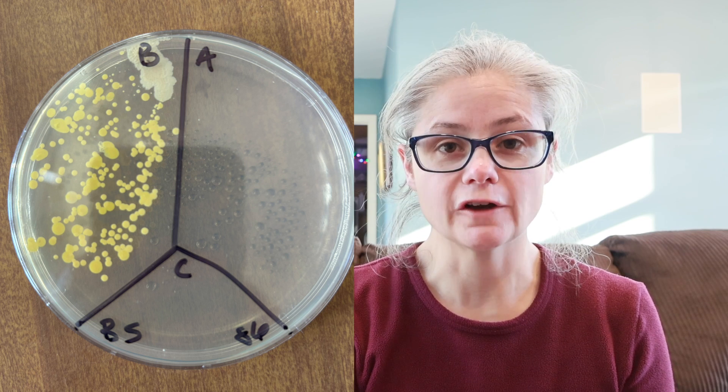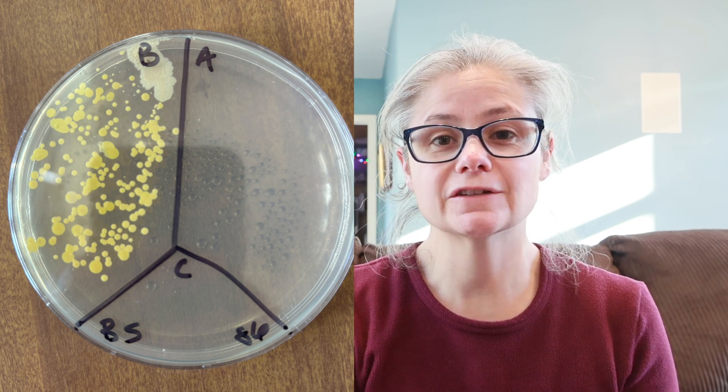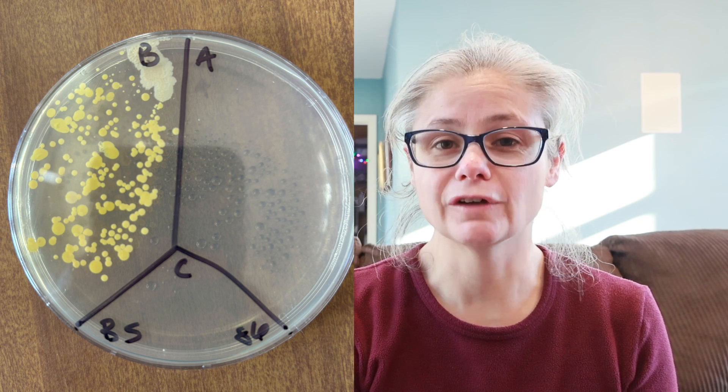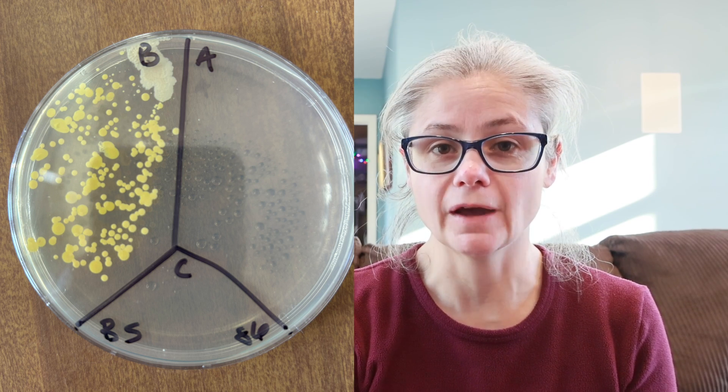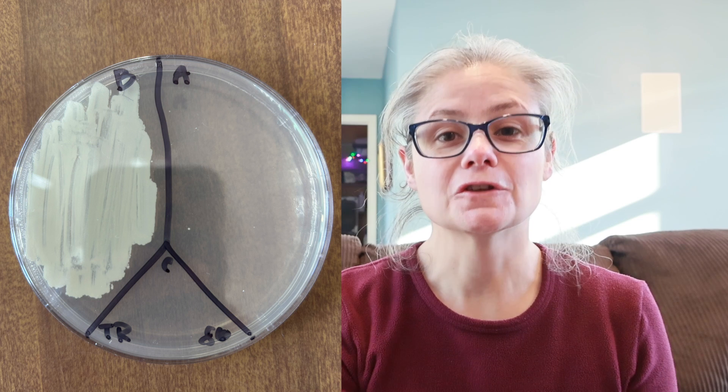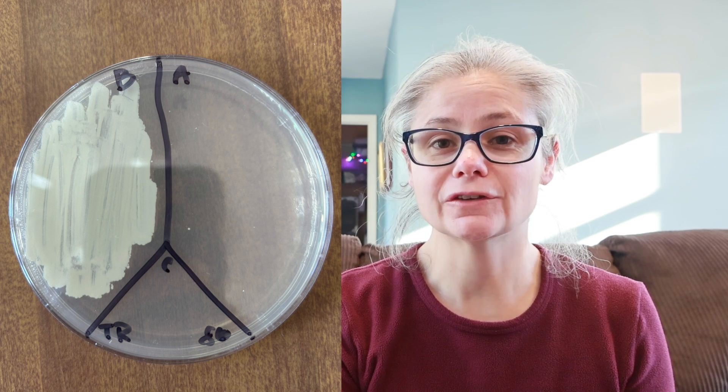The bathroom sink. In the before section, we can see a lot of bacteria. In the after section, there's no bacterial growth at all. So Mr. Clean Clean Freak did a great job of removing the bacteria from my bathroom sink. The toilet rim - in the before section, we have a tremendous amount of bacteria. And in the after section, there are just like three teeny tiny bacterial colonies. So Mr. Clean Clean Freak did an excellent job of removing the bacteria from my toilet rim.